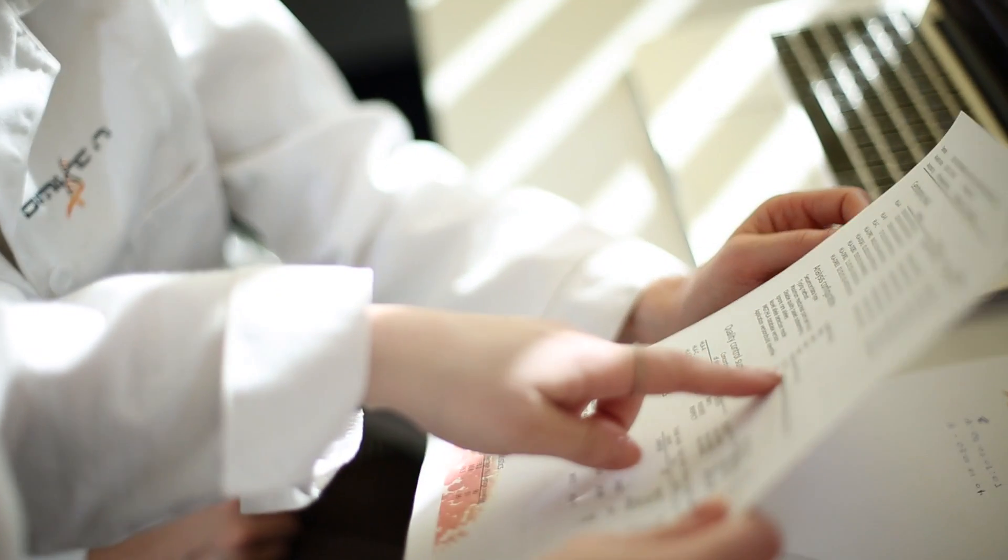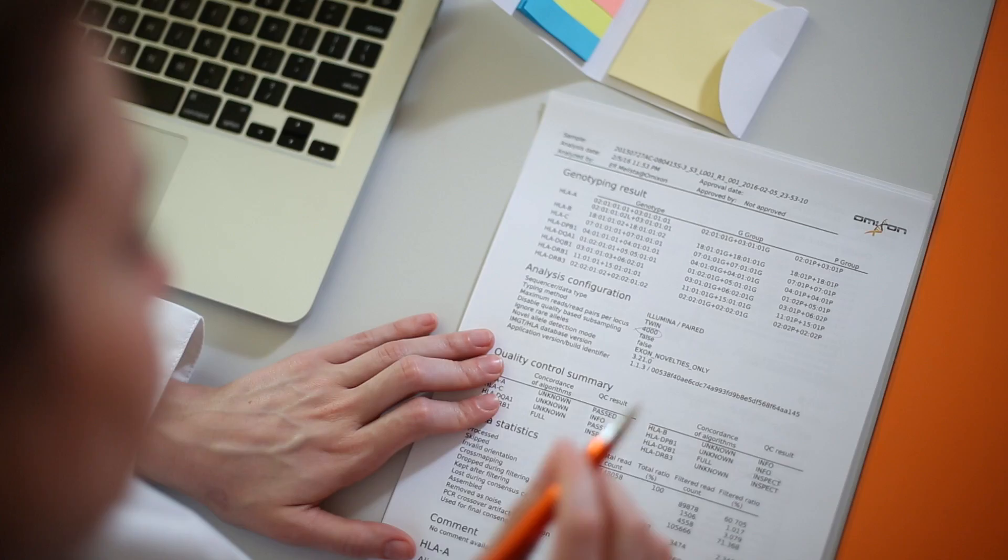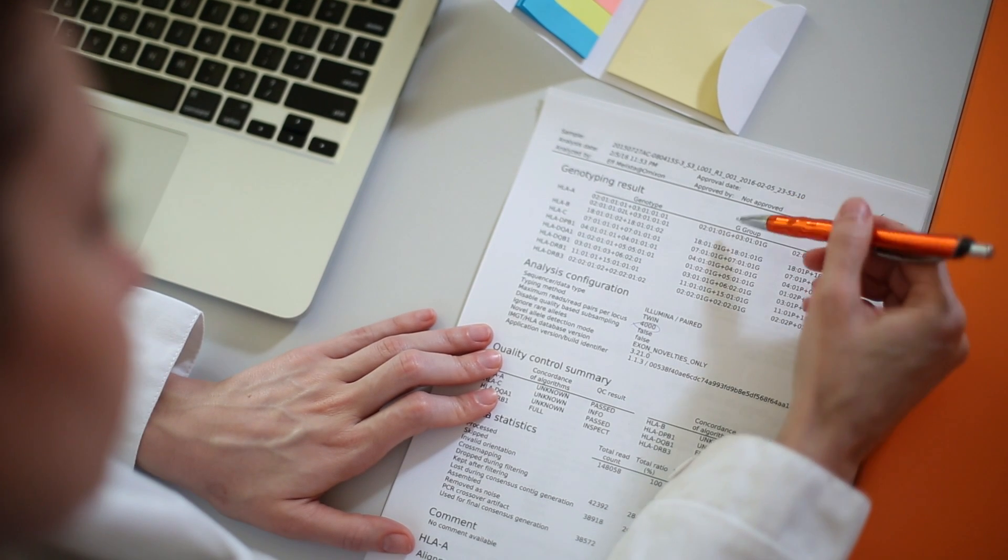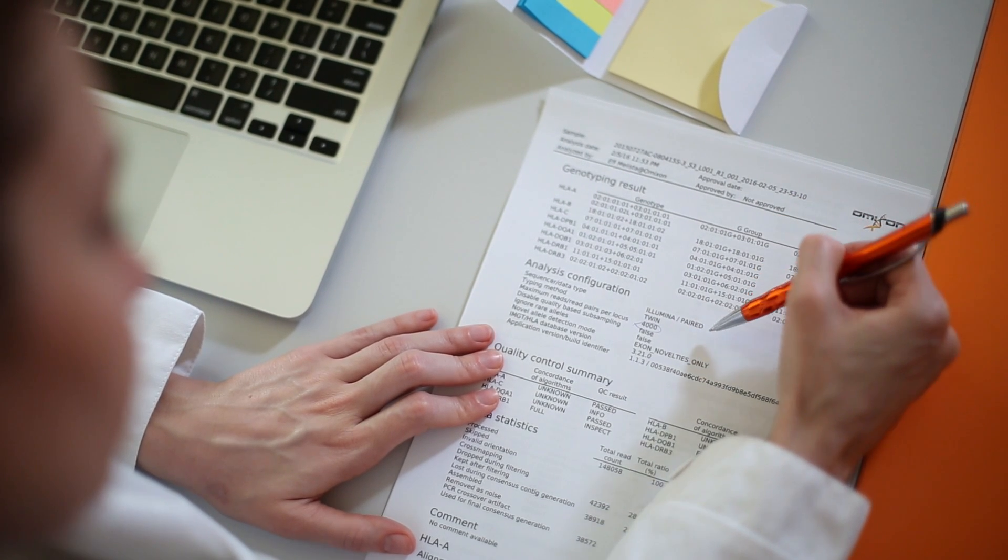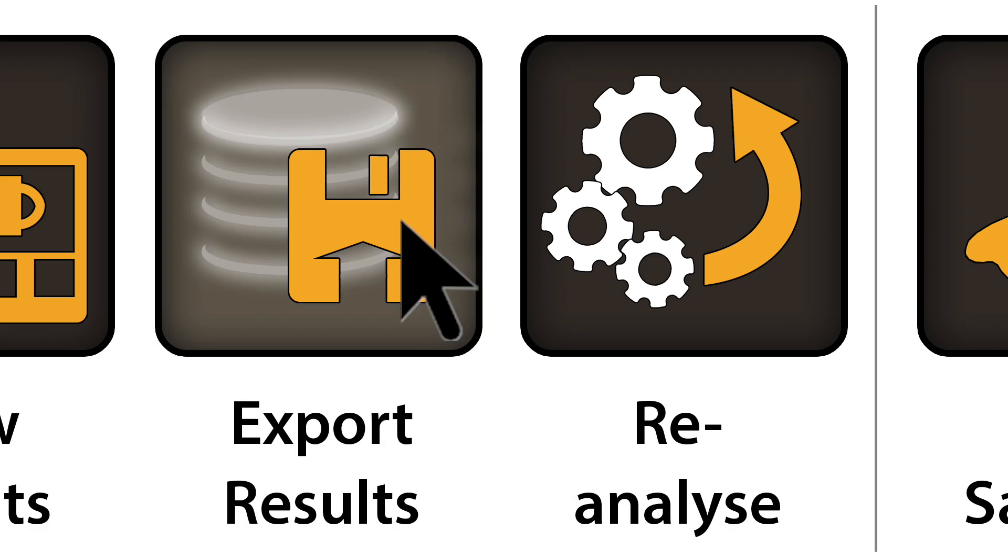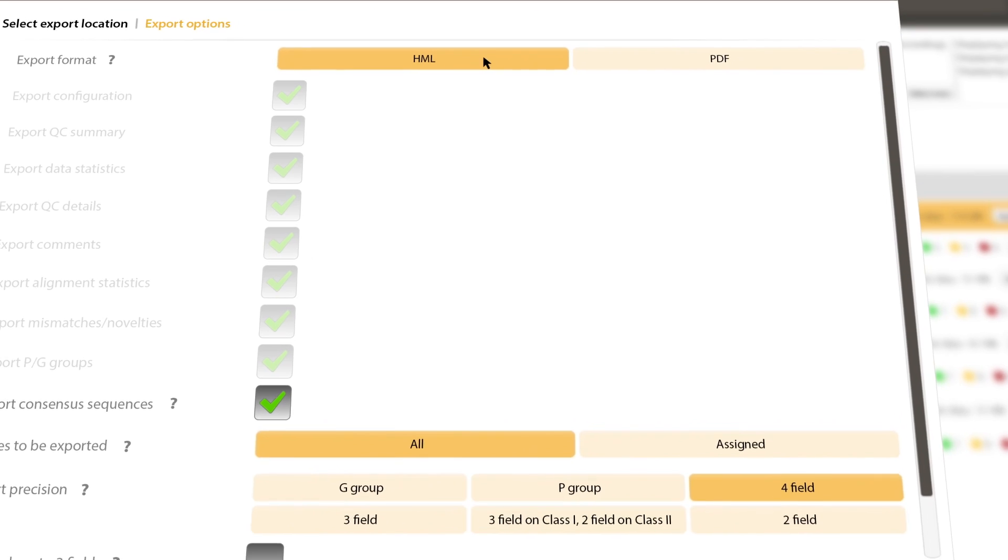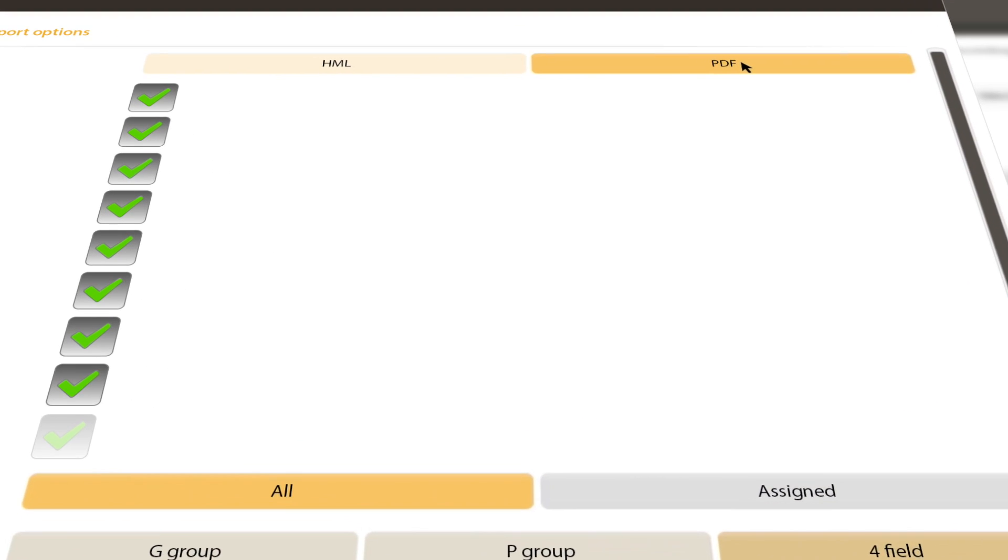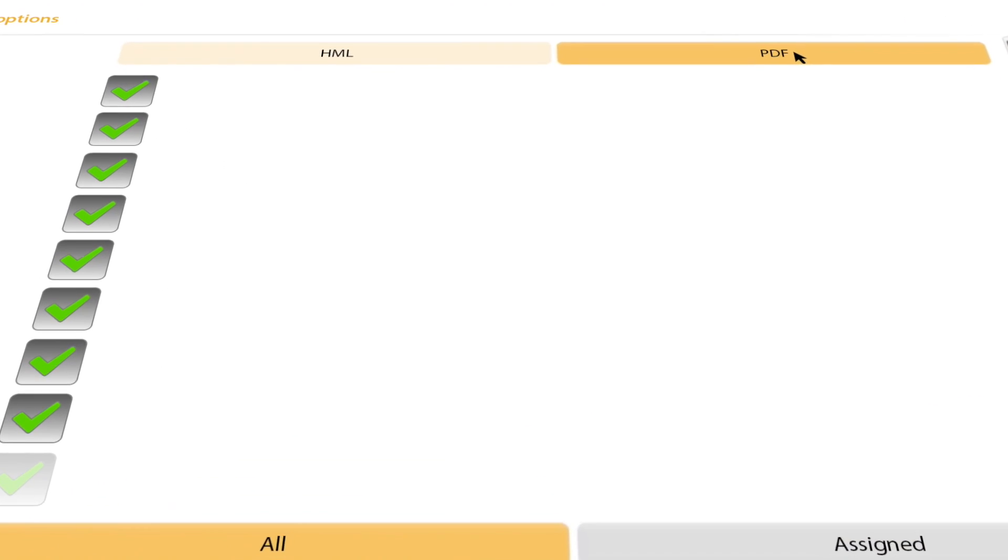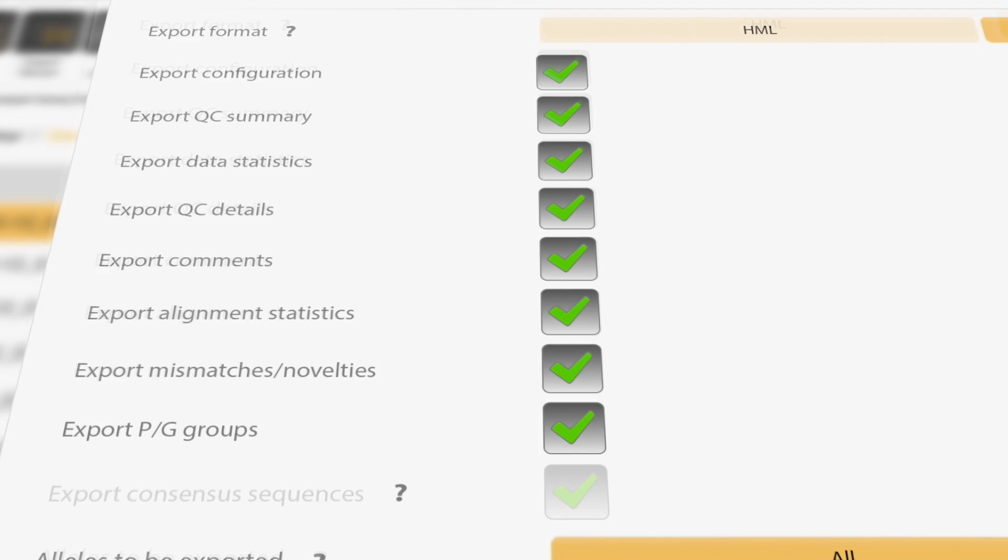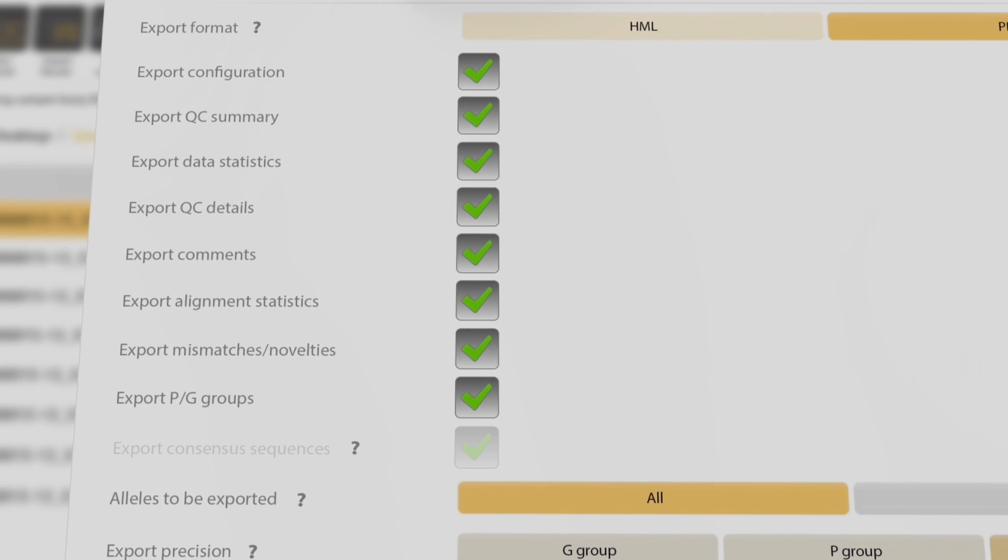Reporting results and archiving in your laboratory information system is easy using the HML 1.0.1 and PDF summary reporting formats. Contents can be customized according to your requirements.